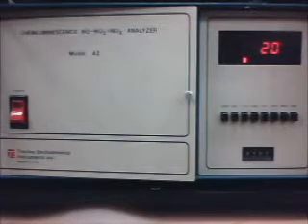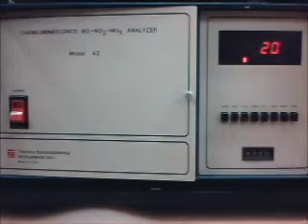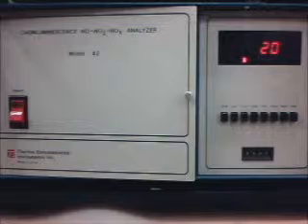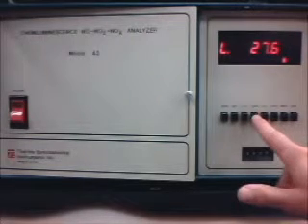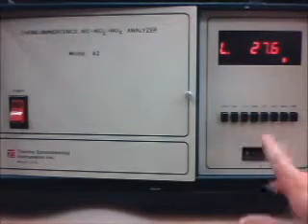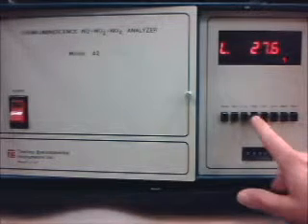I don't know how accurate this is without doing an initial calibration with this cal button. I don't know which one you should do first. I feel like you should do this one first and then the 0 to full scale, or maybe the 0 to full scale first, but I'm not entirely sure. Anyway, once we do that, then we have this display button, which was working. I could get it to work earlier, but now it doesn't seem to be doing anything.